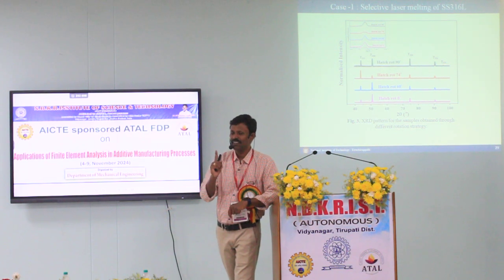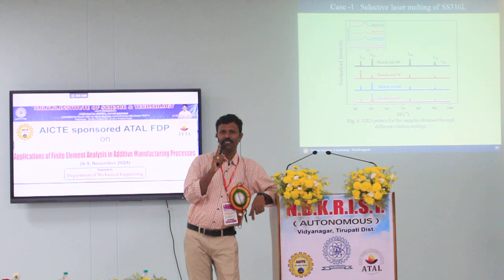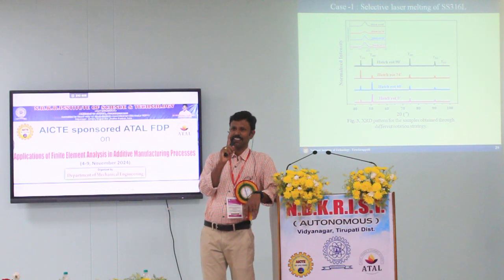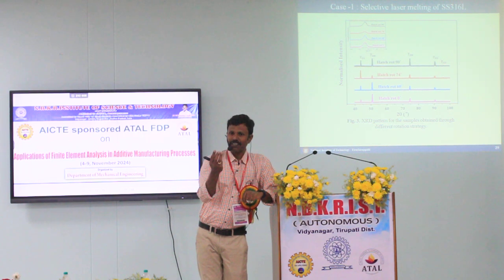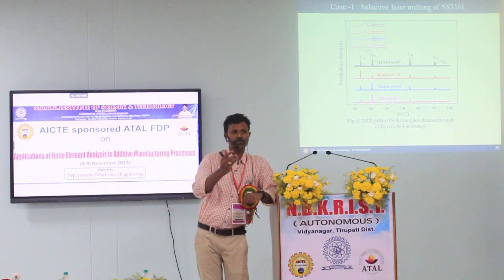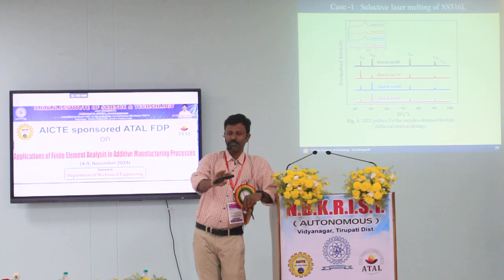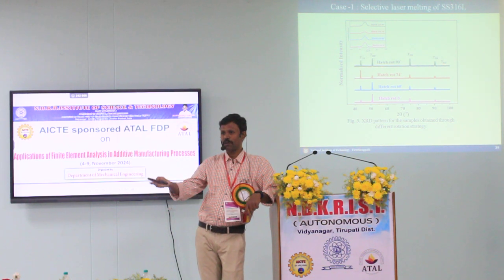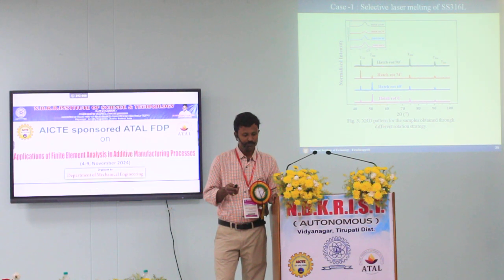In fact, by doing one XRD in 2012 or 13, I have done one paper from one XRD. It was published in Physica B. It was to study how precisely we can calculate the crystallite size and the grain size using this, and correlating with other things with a statistical approach. So this is one small paper we have written. One paper is published in Physica, one paper published in Materials Science. How we can explore it, nothing else.